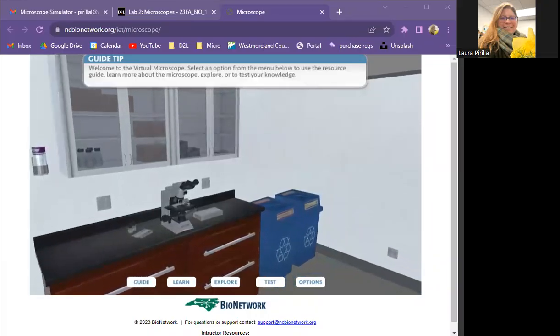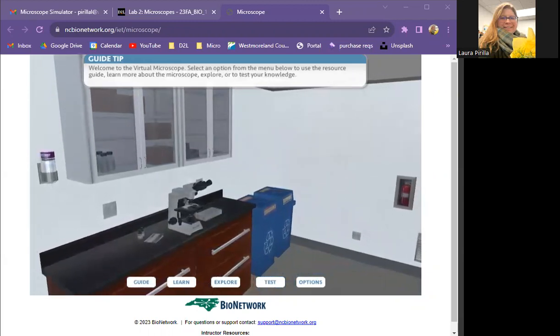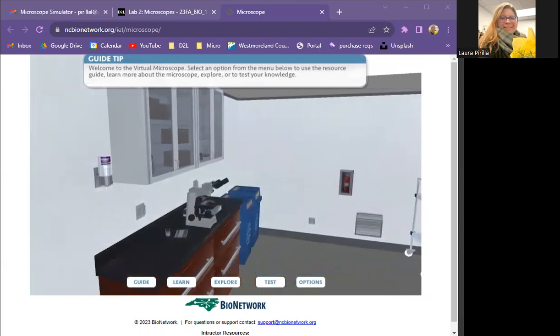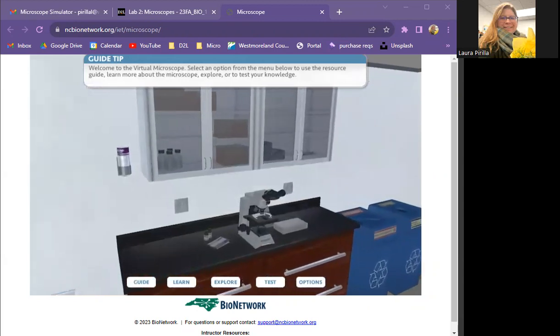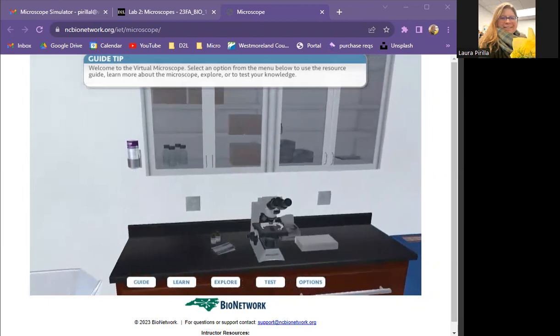Hello. So in case you are trying to use the virtual microscope activity and it doesn't seem to be working on your computer, at least you can view this video and follow along. Maybe pause and replay some parts if there's something you need to see again. I'm just going to follow through the instructions that were posted on D2L and let you see what's going on.